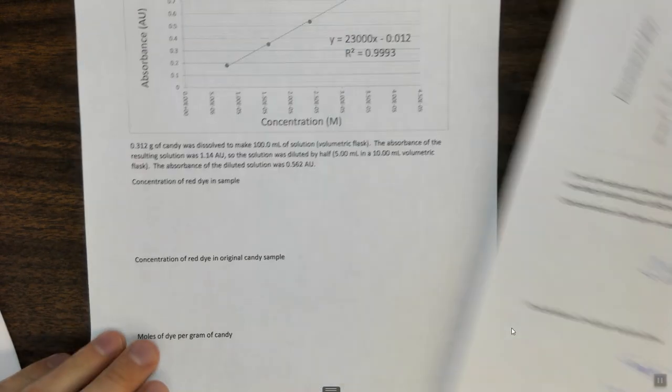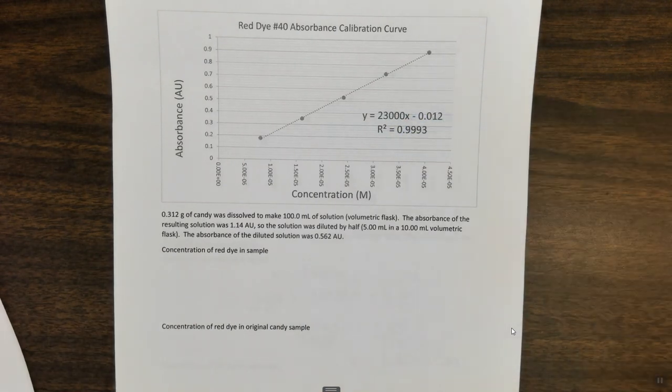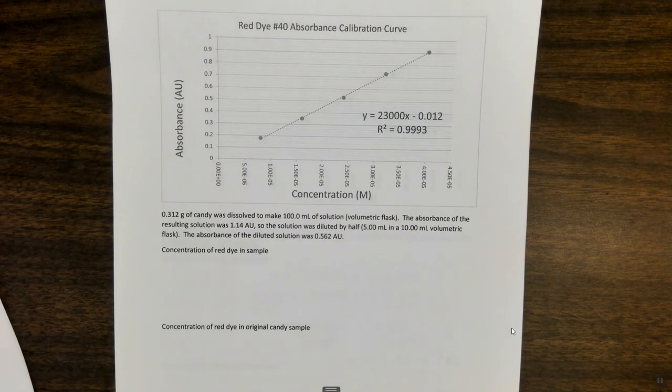Next, let's look at the candy. Good news for the candy. We have the same calibration curve. This is just a copy of the exact same calibration curve because it's the same dye. In my case it's a red candy, in your case it's a blue candy, but either way it's the same dye, so we can use the same calibration curve. In my example, again, just like the previous one, it's a made up example. Don't expect your numbers to be exactly the same.